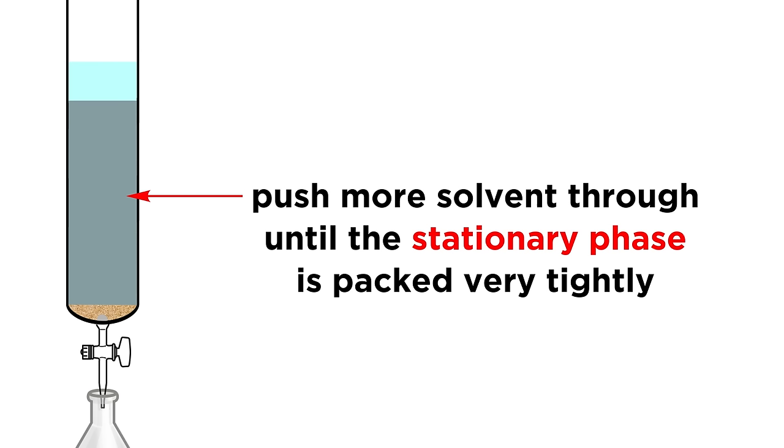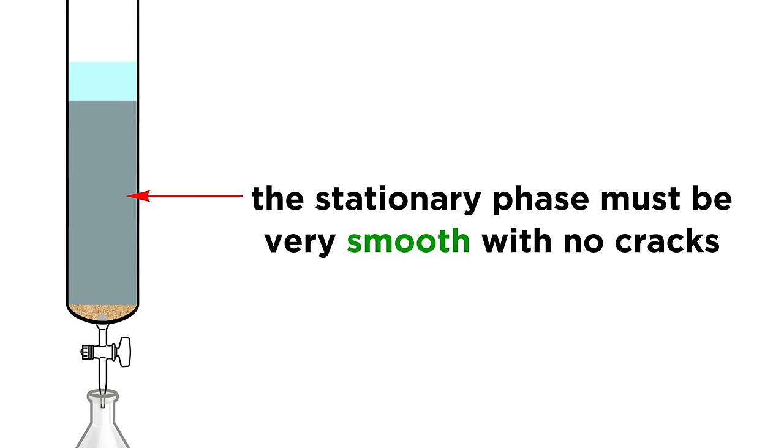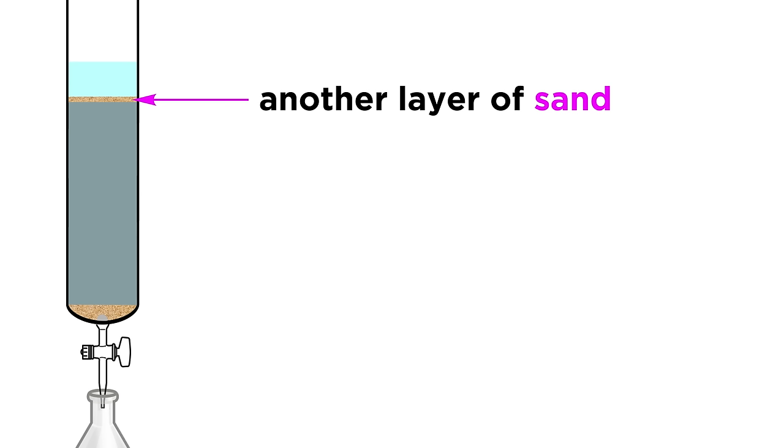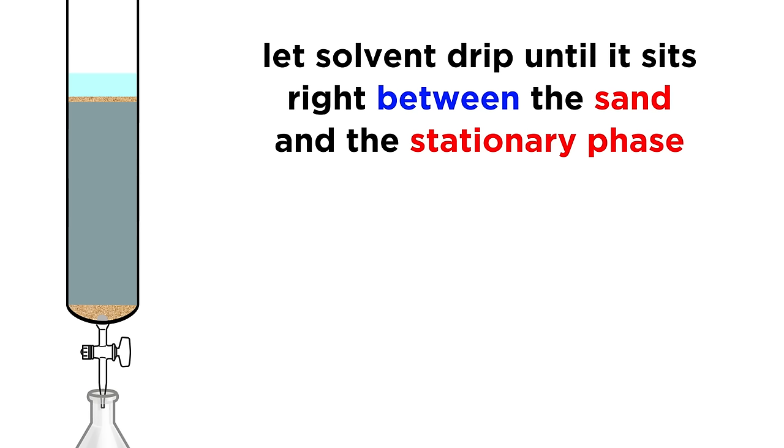While packing the column, use more solvent if you need to. We just need the stationary phase packed down tightly. It is very important that the stationary phase is completely smooth, there can be no cracks or uneven sections. Once that's all set, we place another layer of sand on top of the column, and then allow the solvent to drip until it sits just between the sand and the stationary phase, without going below.